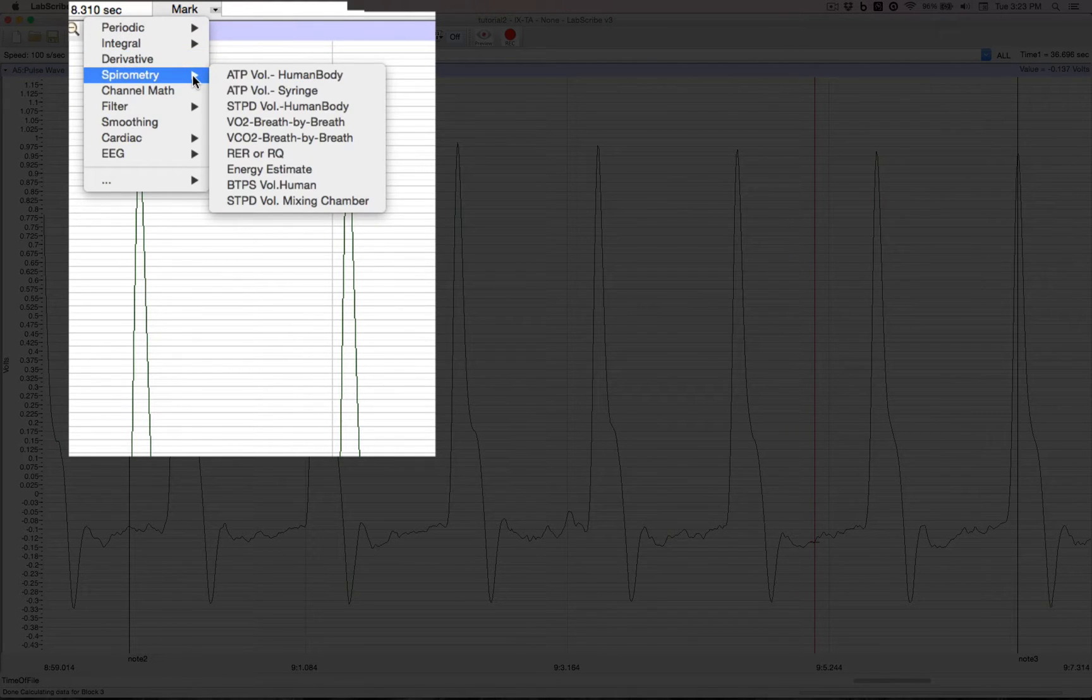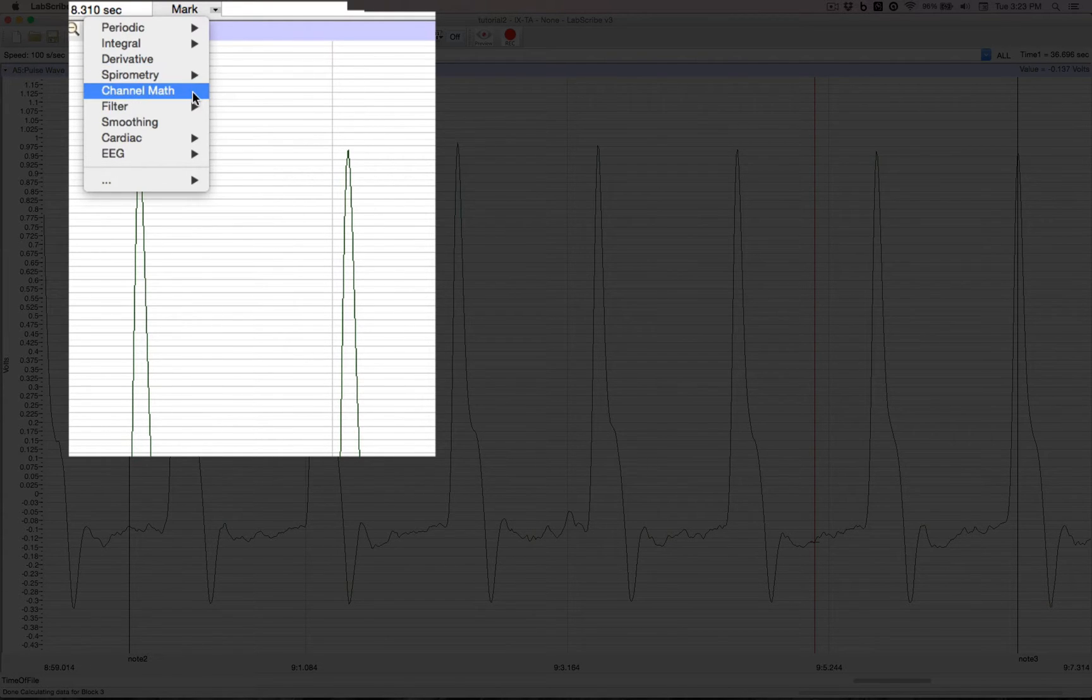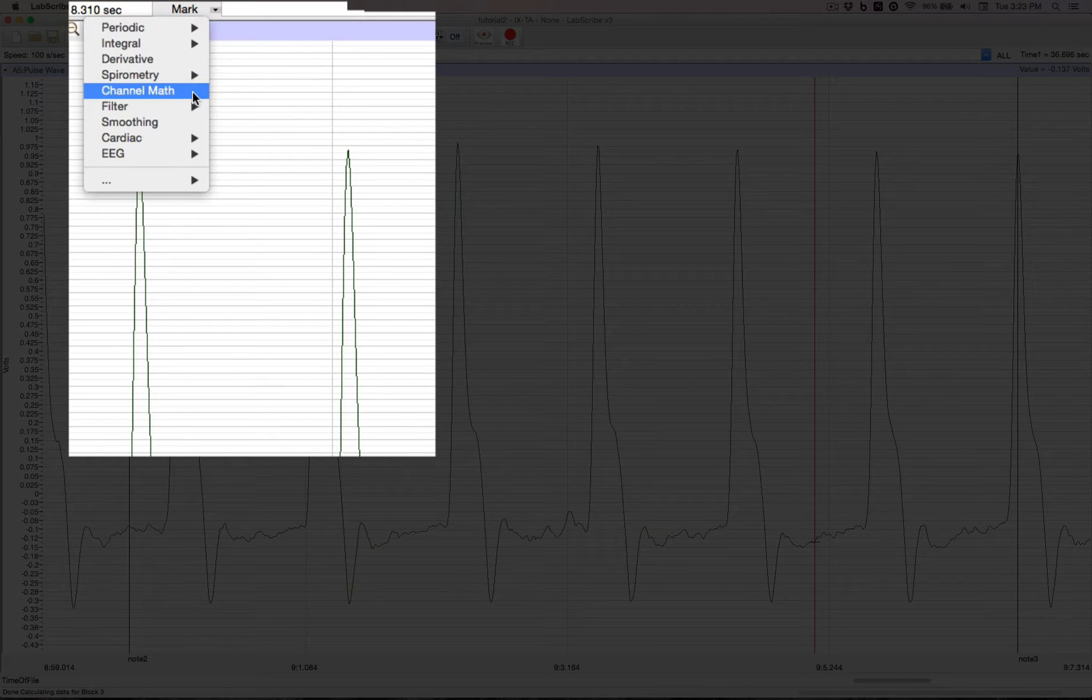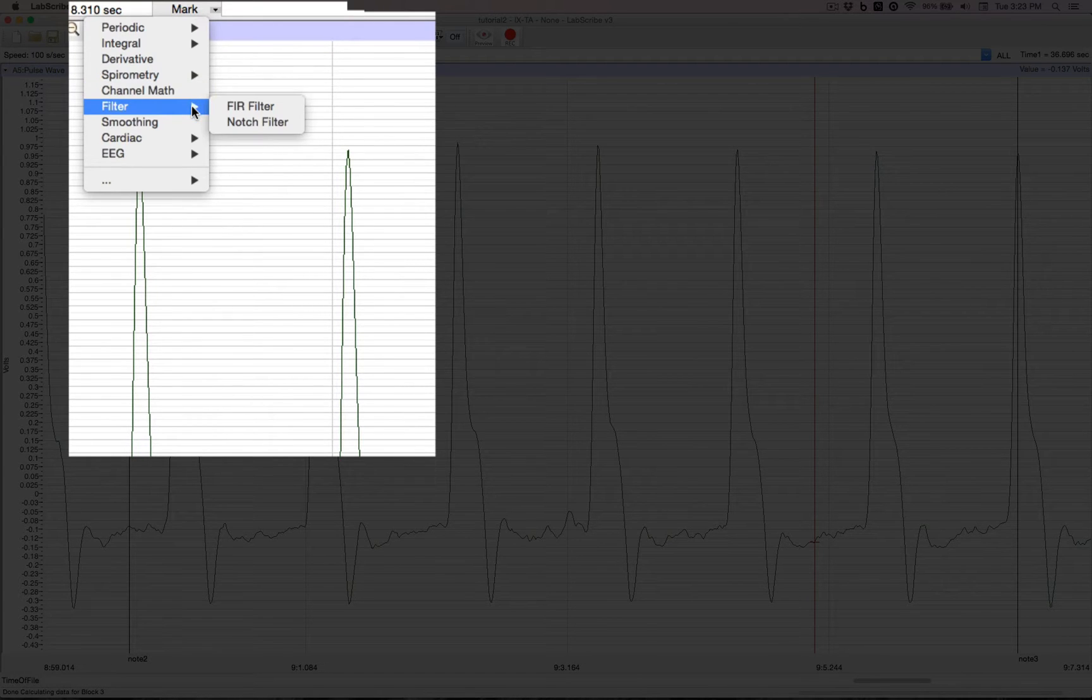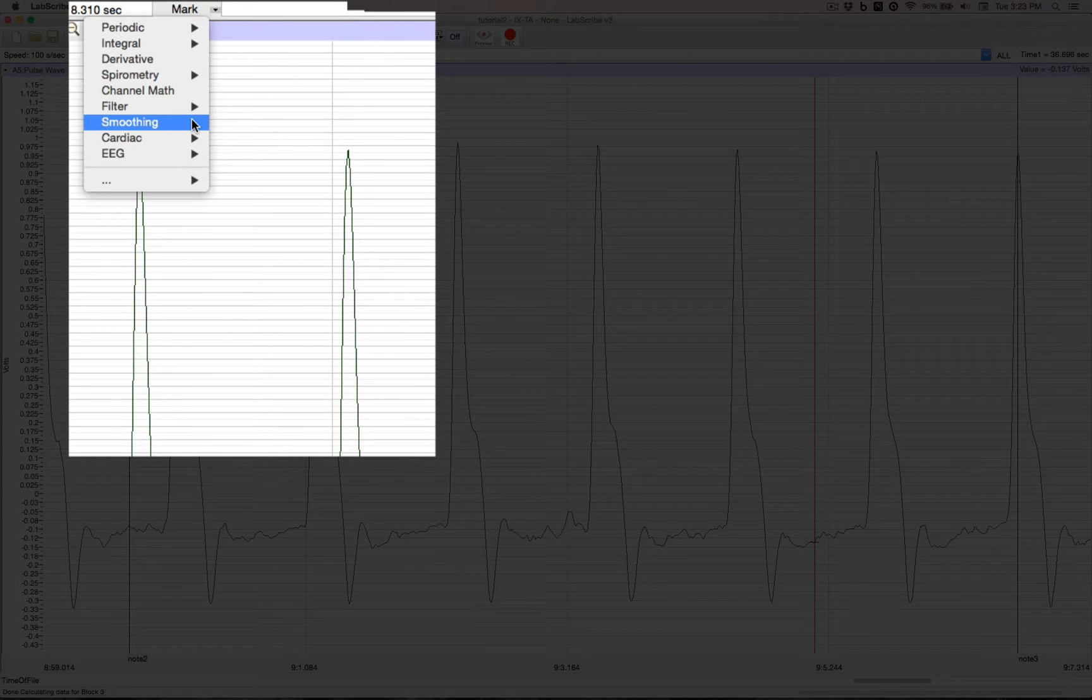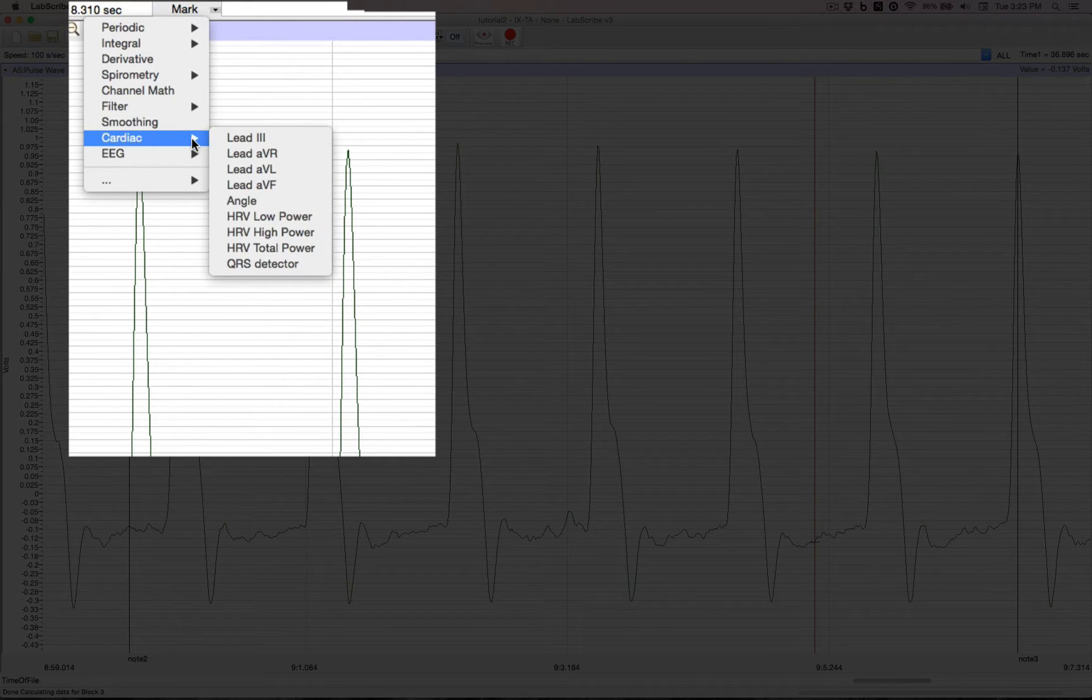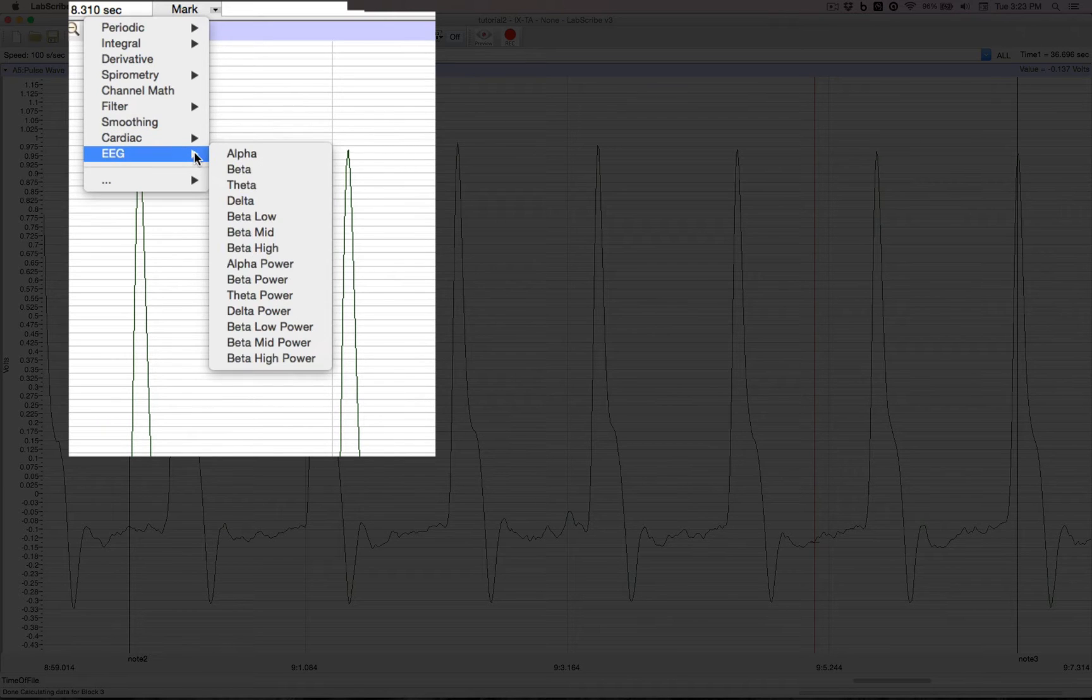Spirometry for pulmonary functions as well as exercise physiology. Channel math. You can roll your own formulas. Various filters. Smoothing capabilities. Cardiac for electrocardiography. And EEG for psychophysiology.